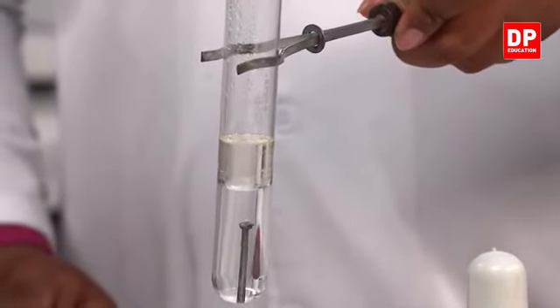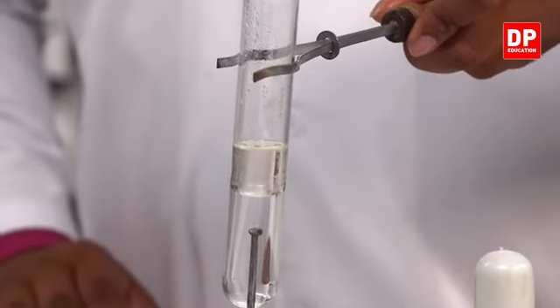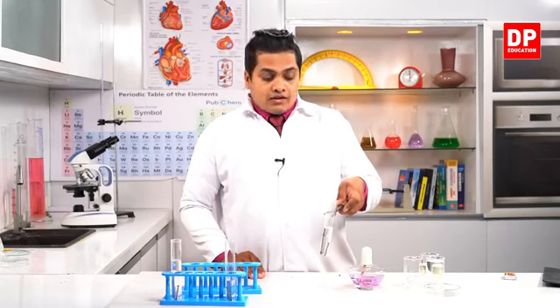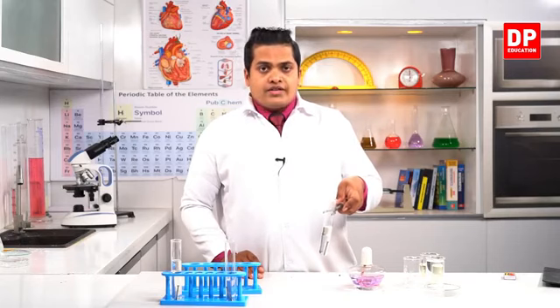So the atmospheric gases will not get dissolved inside the water. So it inhibits the dissolving of atmospheric gases in normal water. So the purpose of adding coconut oil is to avoid the dissolving of gases within water.